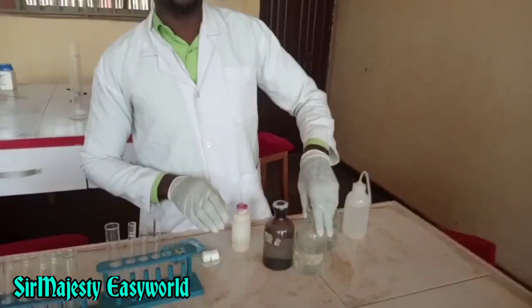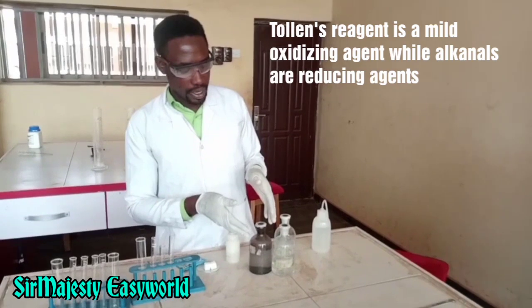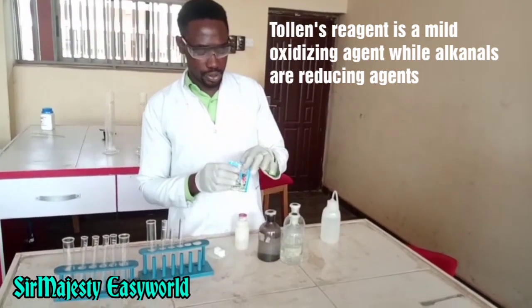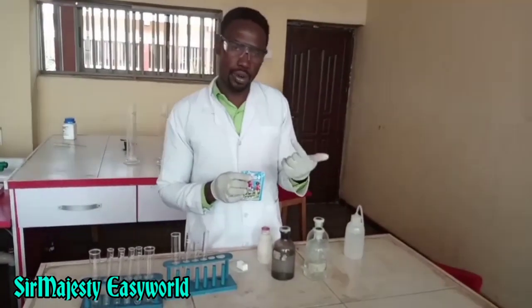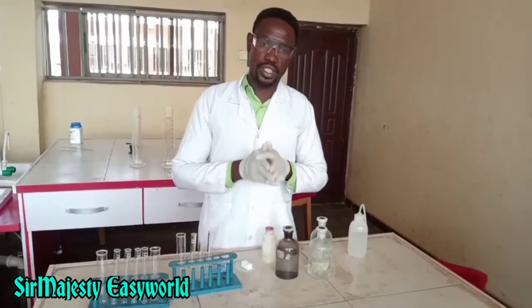This is based on the fact that Tollens' reagent is a mild oxidizing agent because it has the silver nitrate, while the aldehyde is a reducing agent. So the aldehyde will reduce the silver nitrate to silver metal, and it will form a silver mirror on the walls of the test tube. So let's get started.